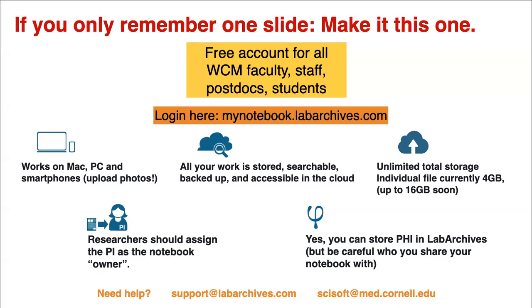Okay, so this is the most important slide, just everything condensed here. So if you remember only one slide, maybe this is the right one to remember. So first of all, it's a free account for all WCM faculty, staff, postdoctoral students. So everybody has an account as soon as they join. And the place to log in here is mynotebook.labarchives.com. I will show you in a little bit. We're going to do actually a demonstration of things.